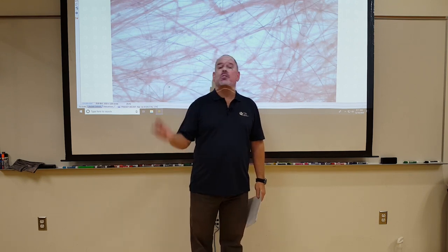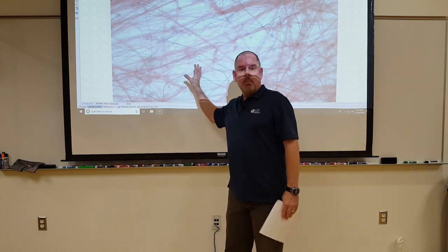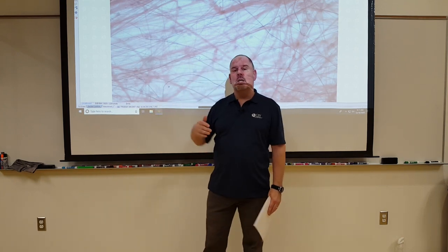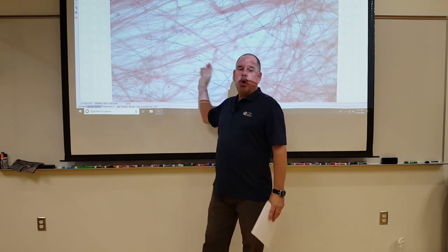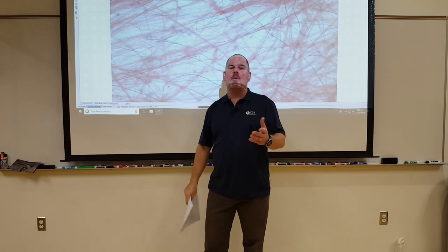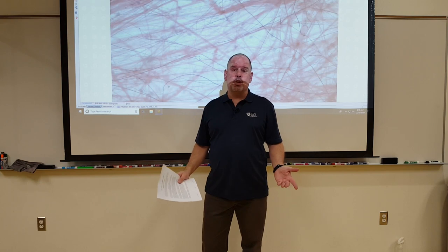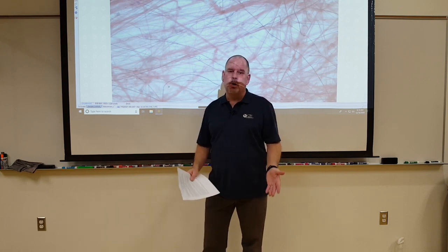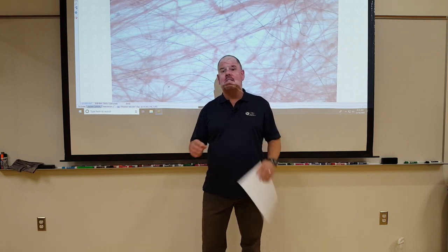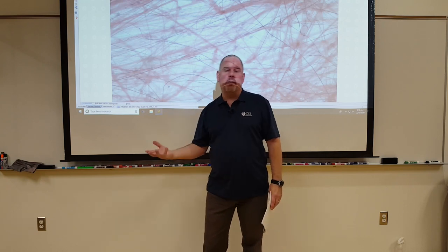So what we will do, as we did in lab number one, I will show you actual micrographs of these tissues, and I'll attempt with the connective tissues to show you maybe one or two different appearances for each one. Some students once in a while run into a problem of saying, hey Duane, all the tissues look the same. Well, they actually don't. There are differences, and what you have to focus on are the distinct differences between one connective tissue and the next.